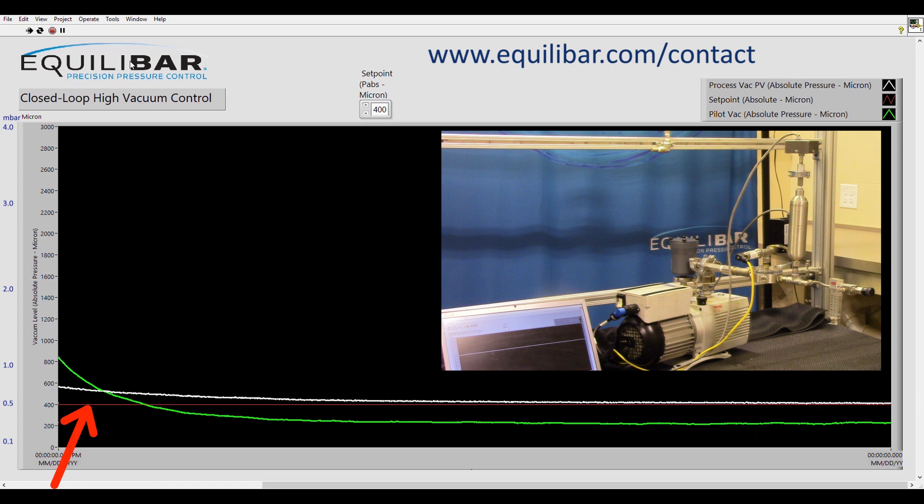The red line shows the desired set point for the absolute pressure in micron. The white line shows the actual process pressure. The green line shows the pilot pressure applied to the dome of the Aquilibar vacuum regulator.